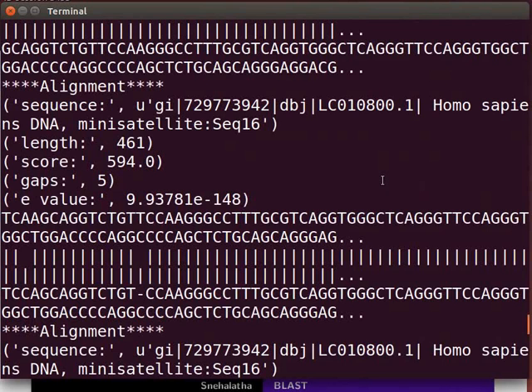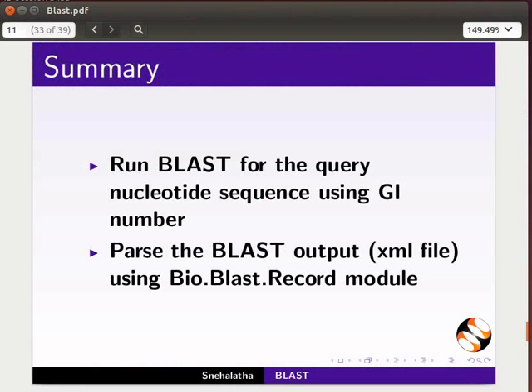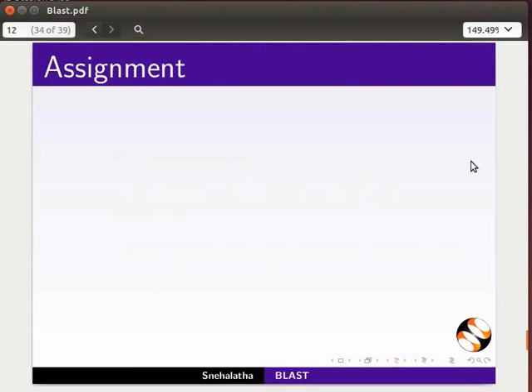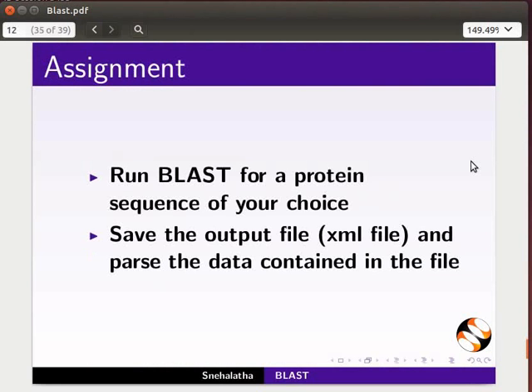We have come to the end of this tutorial. In this tutorial, we have learned to run BLAST for the query nucleotide sequence using a GI number and parse the BLAST output using the bio.blast.record module. For the assignment, run a BLAST search for a protein sequence of your choice. Save the output file and parse the data contained in the file.